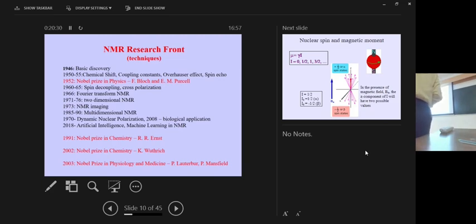And in 1970, dynamic nuclear polarization came in. This was actually an old idea, that information is transferred from the electron to the nucleus. That is dynamic nuclear polarization. But it came into prominence once again in 2008 with biological applications. Bob Griffin at MIT started using it and demonstrated its use. And then, of course, in solid-state NMR, this became quite useful.